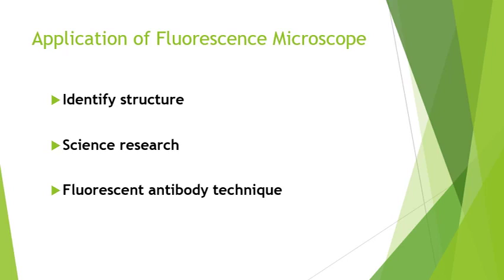So for antibody studies, the fluorescent microscope is one of the basic items needed by scientists. Basically, one particularly powerful method is the combination of antibodies coupled to a fluorochrome, as in the immunostaining technique.